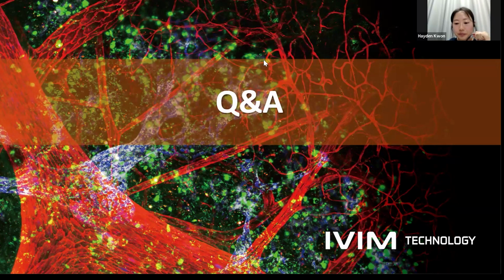So one of the attendees asked about the method for anesthetizing the rats. In our lab, we mostly utilize ketamine to anesthetize the mouse. But most researchers, especially in the States or European countries, are willing to utilize isoflurane gas.